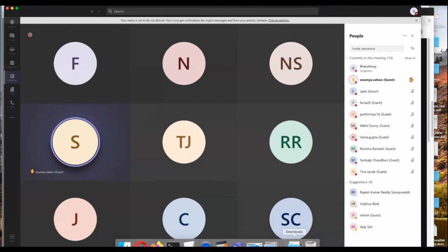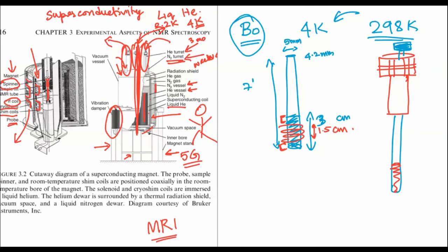Sir, you said that you need to push air for moving the sample up and down. Right? Why do we do so, sir? Because anyway we are putting the sample inside. That's right. Why will the sample come out? So think about it. You saw how big the NMR magnet is. So you're talking about something like 2 feet here. See, remember, this is made of glass.